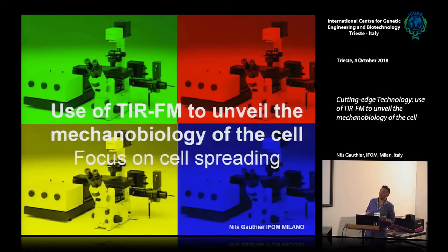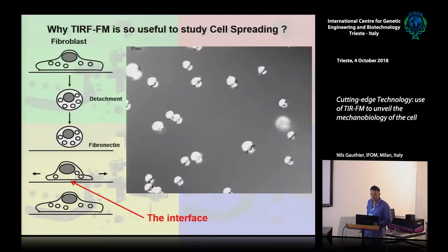I will divide my talk today in two parts. First I will try to give you a hint of TIR microscopy. After, I will show you how, by using several microscopy techniques, we answer a question in the lab that I'm running in Milan. First, let's focus on this beautiful TIR microscopy and on the mechanism of cell spreading.